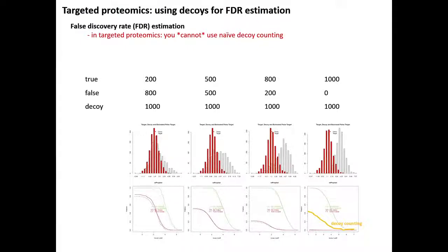Other questions about mProphet? Yeah. So you say that you have to be careful not to remove the bad targets, but if you have a large library, say one created for multiple tissue types, brain, liver, kidney, you have too many bad targets, basically. Well, but is a bad target just poor spectra, or is it something that you know isn't in your sample whatsoever? Because that's searching for something that's not there. You're right.